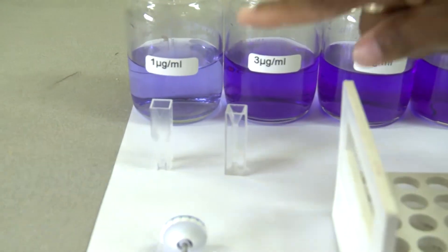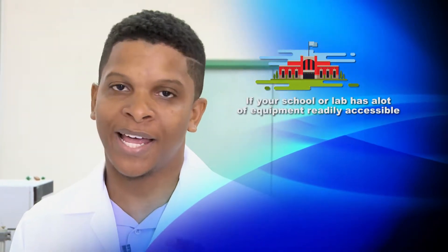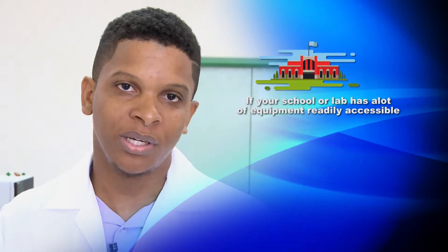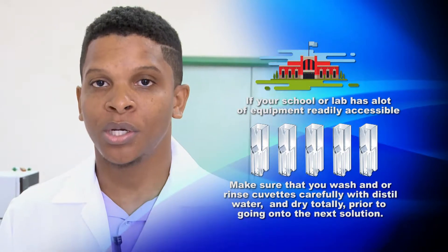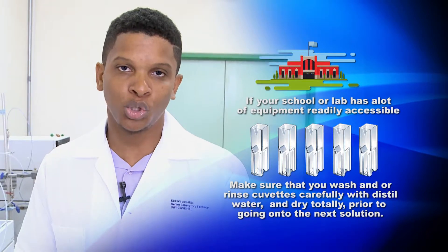And we have the quartz cuvette, made of quartz, which is used for the UV spectrum. If your school or lab has plenty of equipment available, it's okay to use a series of cuvettes or test tubes. If not, you must make sure that you wash and rinse carefully your cuvettes or test tubes with distilled water and dry them totally before going on to the next solution. Cuvettes are very expensive, so please handle with care.